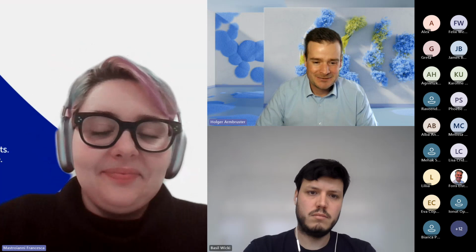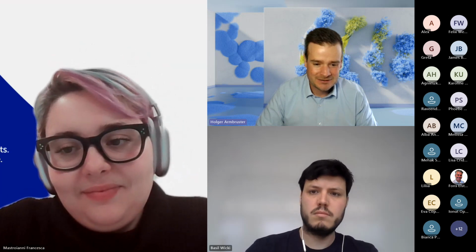And now, Basil, we also have some questions for you. The first one is from Lisa, and it's again about dispensing cells. So Lisa is asking, hey, Basil, was there anything you did to make sure your bacteria was homogenized before dispensing on the I.DOT? Cell settling is an issue in our hands. We use HEK293 cells.